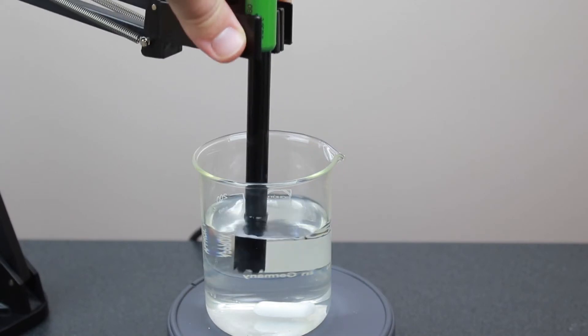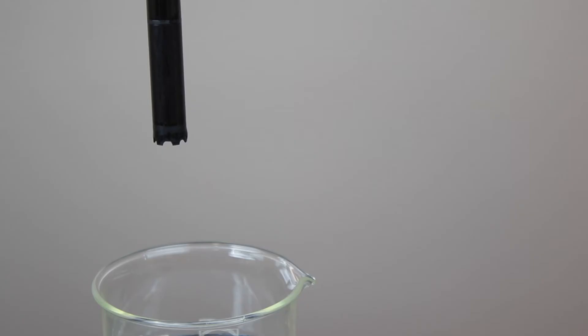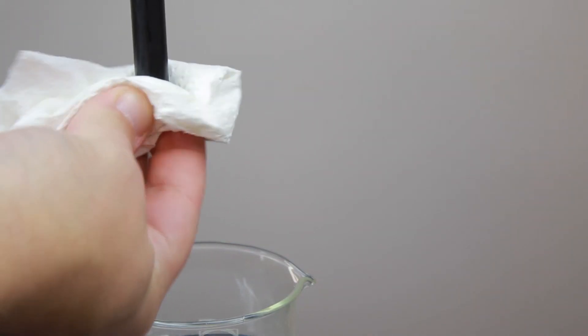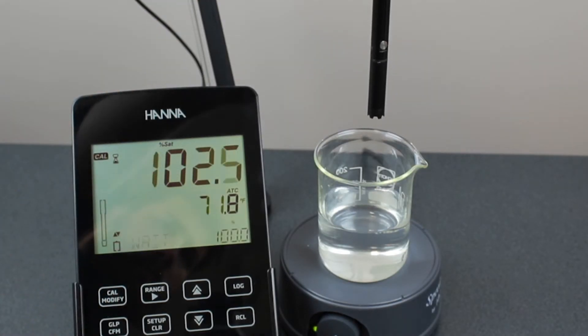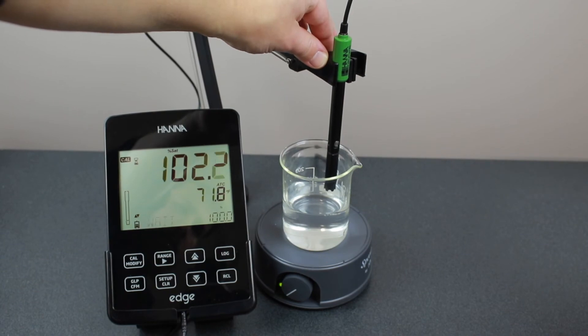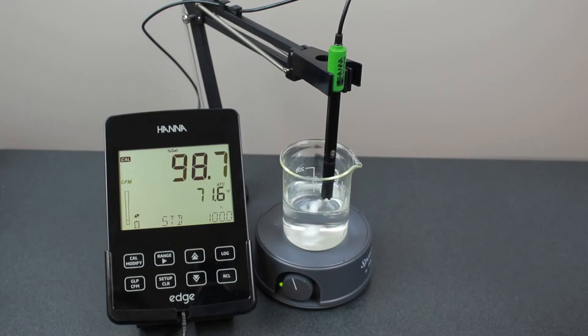To perform a 100% dissolved oxygen calibration, rinse your HI764080 polarized probe with clean water and then dry the tip. Suspend the probe just over a beaker of water and press CAL. When the reading is stable and is within the limits, press confirm.